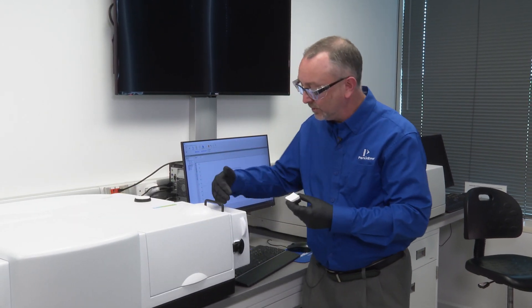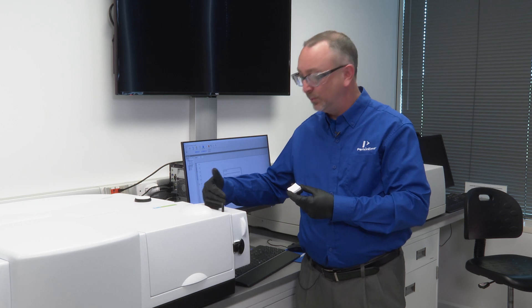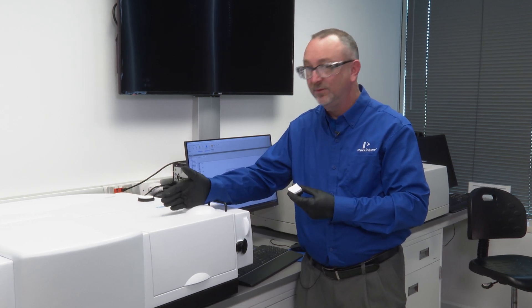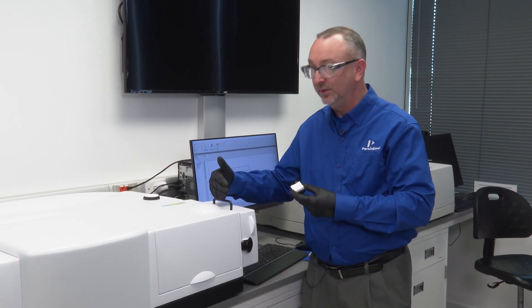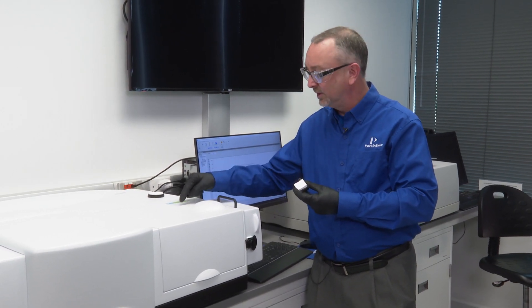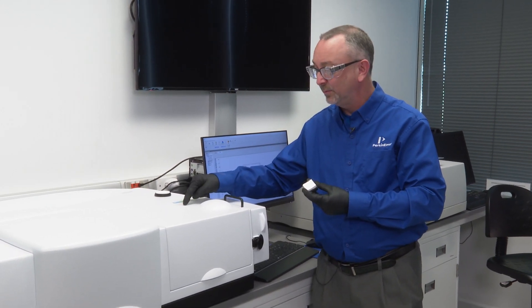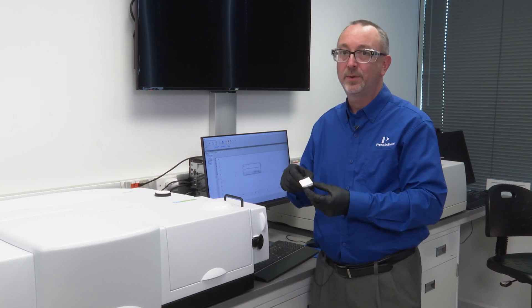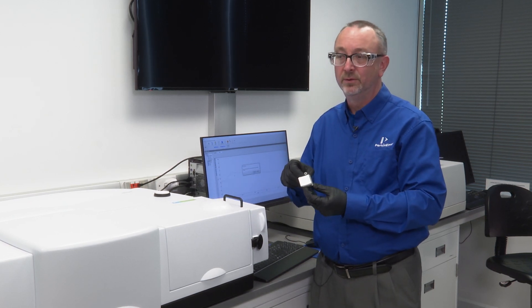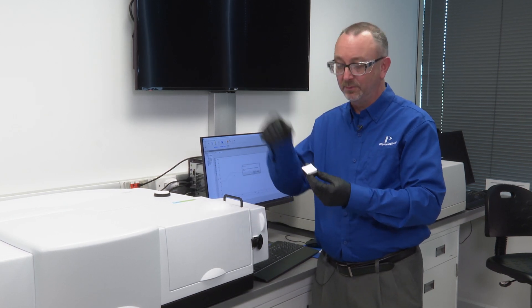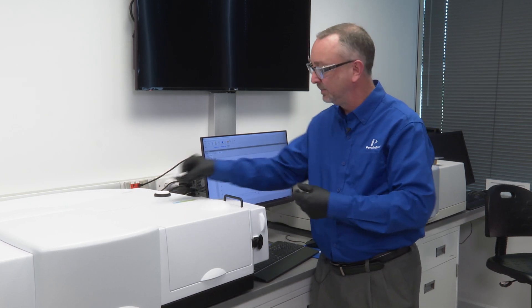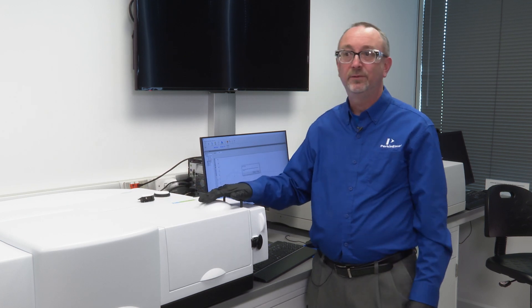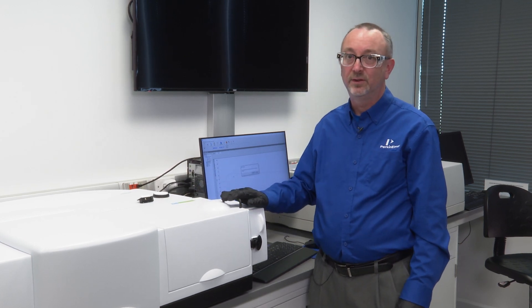The angle at which the sample faces the beam is 8 degrees. Thus this exclusion pool allows any specular component to be dumped from the integrating sphere. Thus we are collecting diffuse reflectance only.